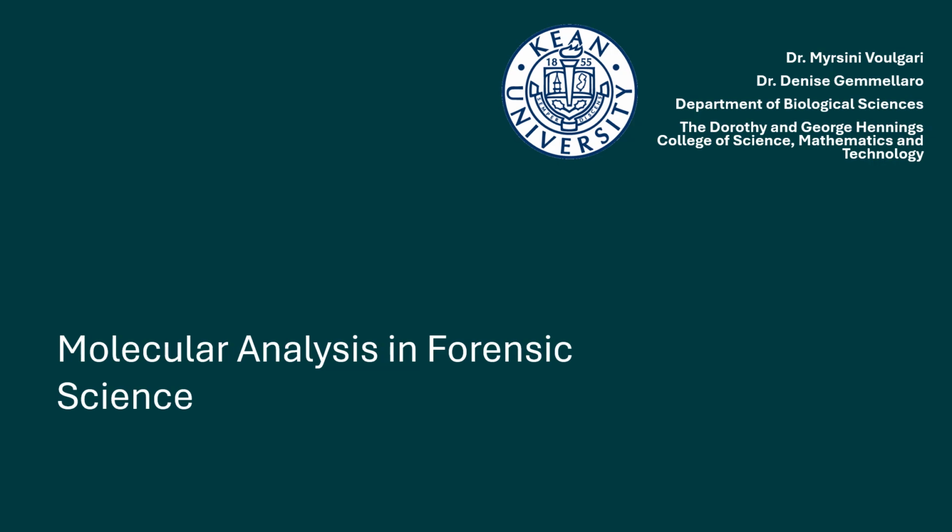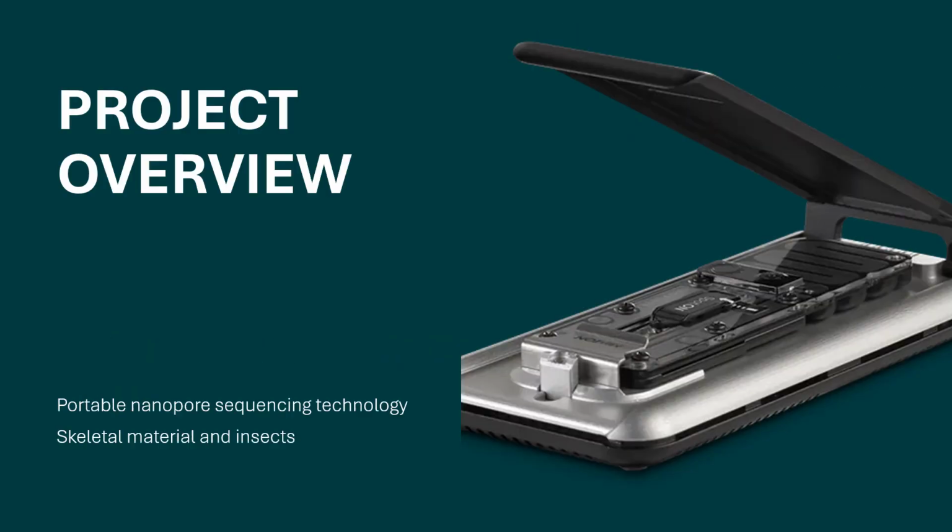This presentation is based on an ongoing project on molecular analysis in forensic science. This is conducted in the Department of Biological Science here at Kean University. This project explores the use of portable nanopore sequencing technology for the extraction and sequencing of DNA from skeletal material and insects, two types of biological evidence that are often encountered in forensic investigations.